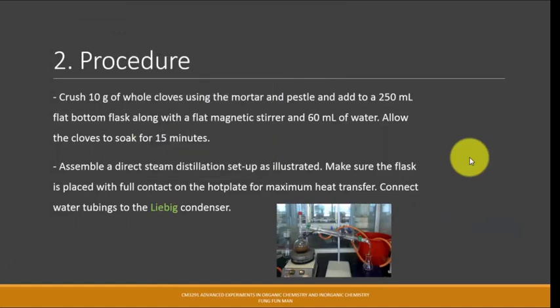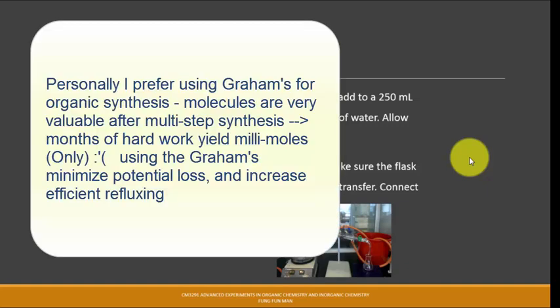In this reaction, we are doing a simple physical process where we change the gaseous state to the liquid state. So both are fine. But if you go to do some higher order research and you'll be using something really expensive and super small milliscale, then I would suggest maybe you can use the Graham condenser, because you do not want any of your compound to just vaporize and go out of the whole reaction setup. You want it to be refluxed, going up and down, right? We don't want it to escape to the environment. $1,000. Wow. Vanish in thin air.